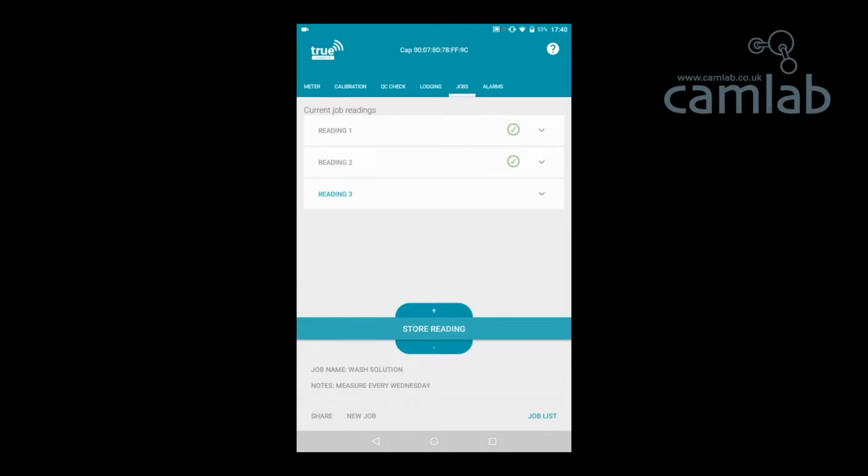If you wish to store a reading but the sample is difficult to access, you can set a timer. Touch the plus and minus icons either side of the green band to increase or decrease the timer. When the desired time is reached, touch the central Store a Reading in X seconds to start the timer. Use this time to take the cap to the sample. You can leave the tablet behind at this stage, providing it is still in range.